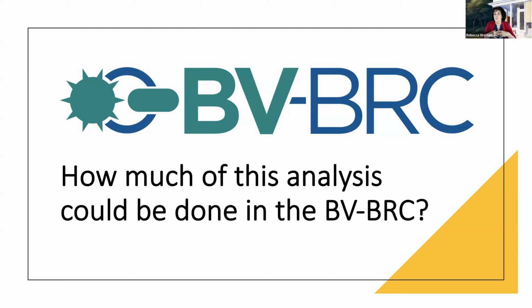These researchers went to a lot of different sources. They used a lot of different software to try to do this analysis. And remember, every time you're changing from one software pipeline to another, there's often some massaging of the data that you need to do. So think about that when you're doing your analysis.